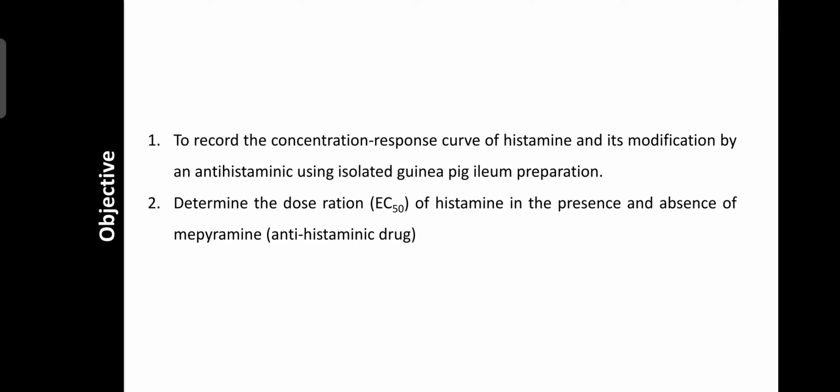So the objectives of this experiment are to record the concentration response curve of histamine and its modification by an anti-histaminic using isolated Guinea Pig Ileum preparation, and determine the dose ratio, that is EC50, of histamine in the presence and absence of mepyramine. Mepyramine is an antihistaminic drug.